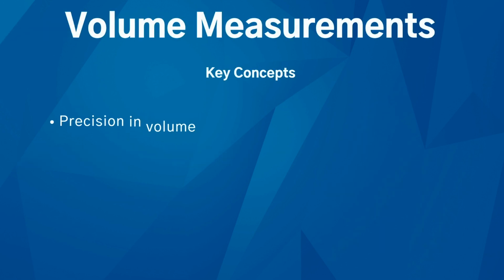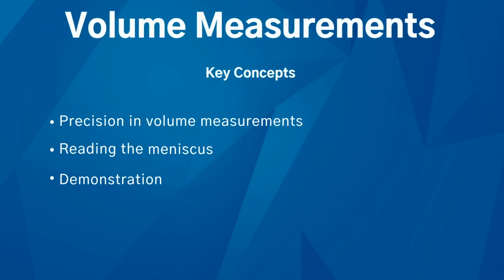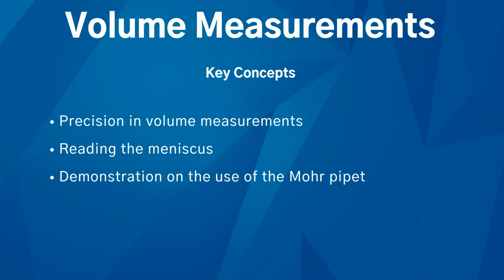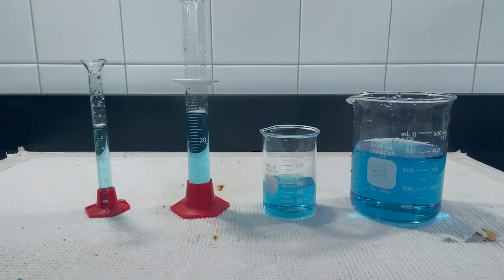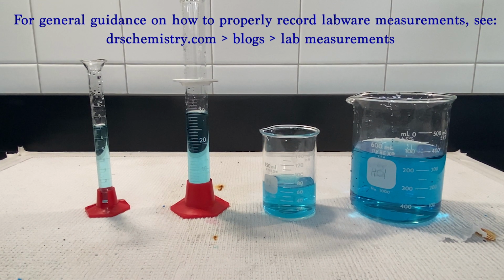Welcome to the Volume Measurements Lab. Be sure to follow along in your lab manual, and there we're going to learn about precision and volume measurements, reading a meniscus, and using a Mohr pipette. The first part of it deals primarily with just beaker and graduated cylinder measurements.